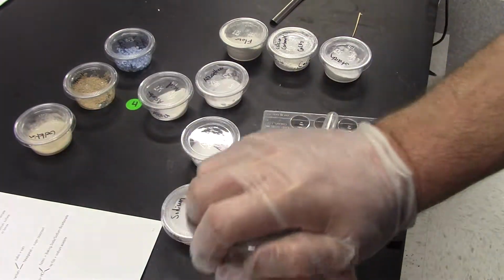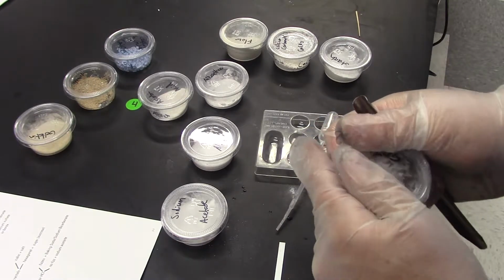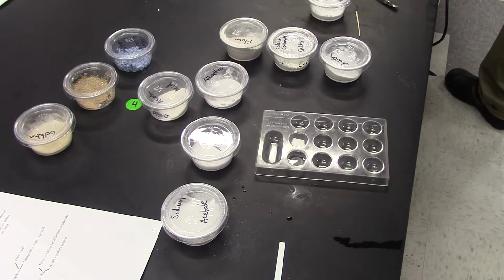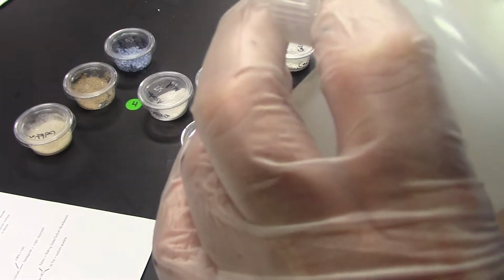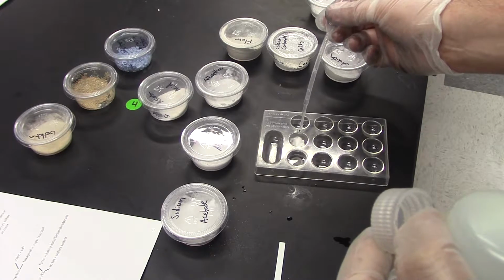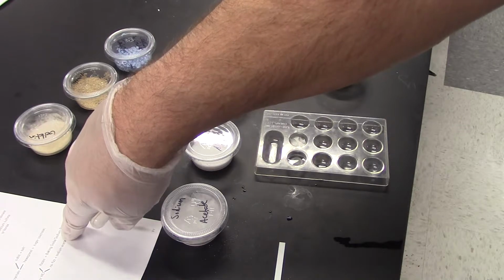The next thing I could do is get another sample. And then I can add vinegar to it and see what happens. If you ever made volcanoes when you were younger, you should get a reaction that looks like that. It should be pretty fizzy when we add it to it. So I have just a small amount of vinegar here. I picked up a new pipette. I'm just going to add a couple of drops and we're going to see what happens. Definitely fizzing. Alright, if that was sugar or salt, it would not do that. So we're looking at baking soda as being positive.